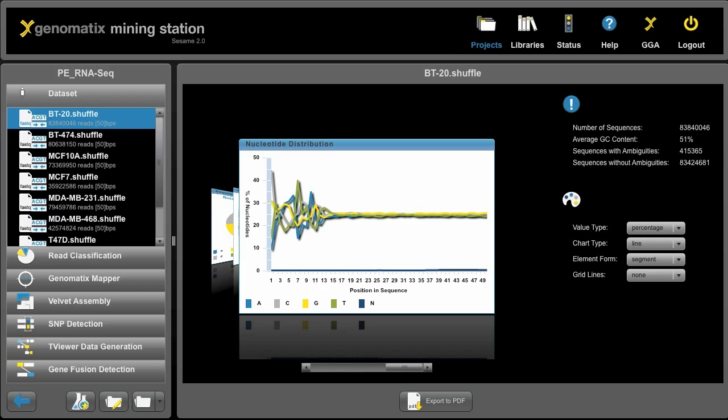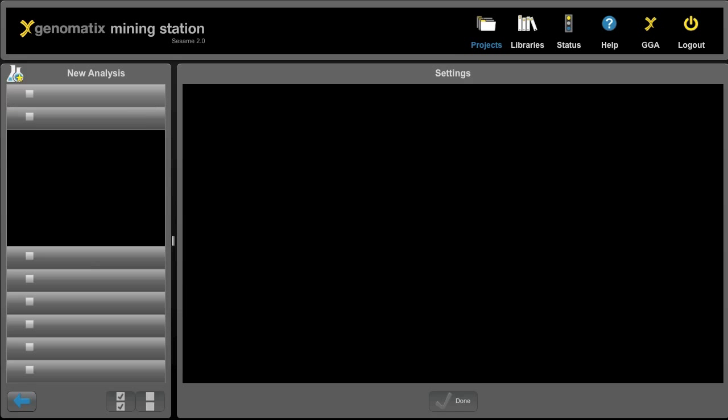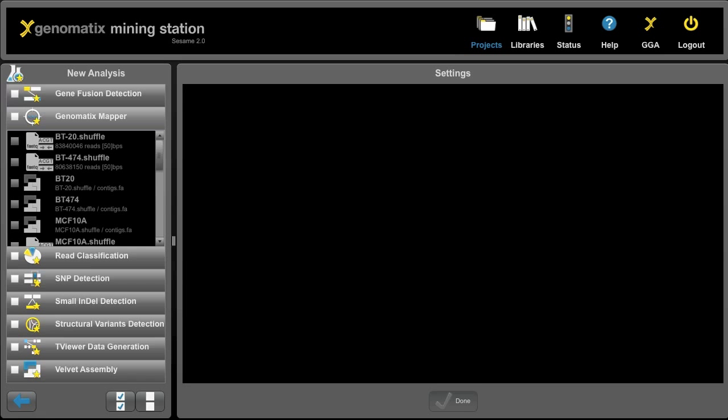Once the read files are all in place, we can start with a mapping. To start a mapping, click on Analyze data down here and then we get a selection of all the analyses we can start.